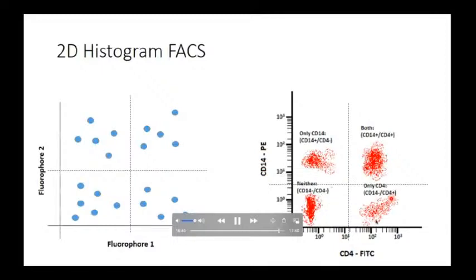As you know, with the new FACS machines, we can analyze tens of proteins and tens of cells at one time. There is now one FACS machine on the market which contains 10 lasers and 30 detectors. Can you imagine 10 lasers and 30 detectors? So you can analyze many proteins and many cells at one time. But of course, the data then will be much more complex than this data. This is very simple data.